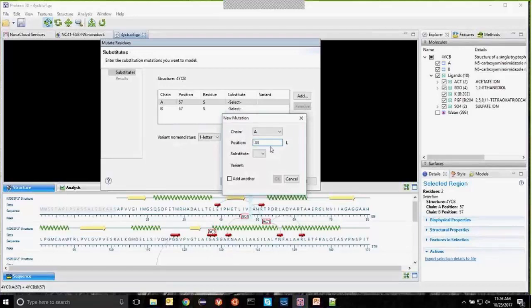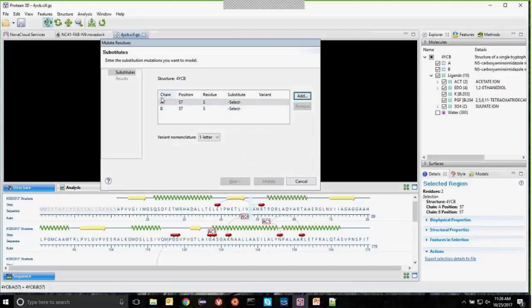I'm just going to type something quick in, and you can actually define the index. We'll tell you the residue, and you can pick a substitute. You could add this one directly. Or from when you have things selected here, you have to select residues from this list. And we're actually going to be doing an alanine mutation since that's what's done in the PDB structure. If you prefer, you have the option to use 3-letter amino acid codes rather than 1 letter.